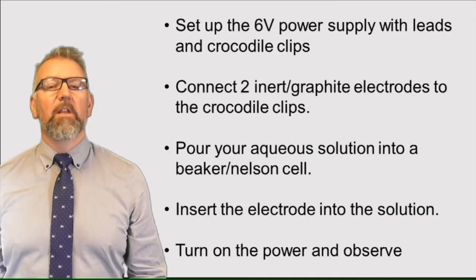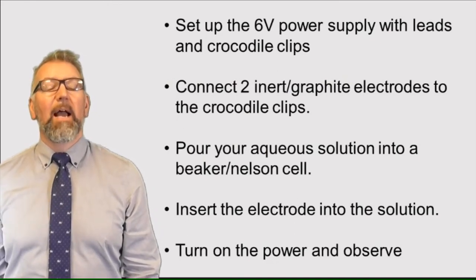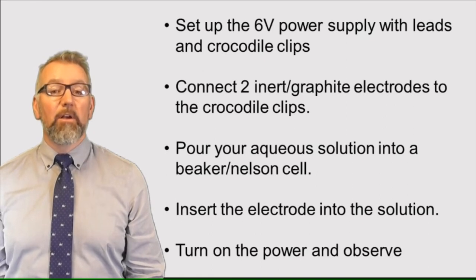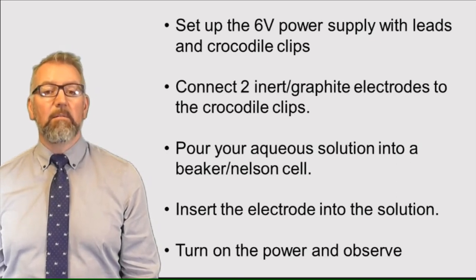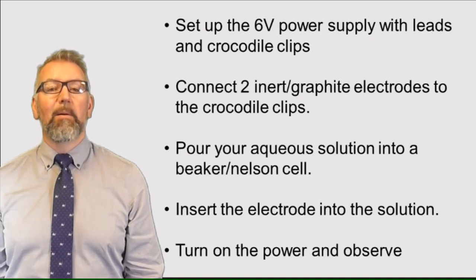Very few questions that I've seen ask you for a method. But if they do, have your method prepared. Set up a 6-volt battery supply with leads and crocodile clips. Connect 2 inert graphite electrodes to the crocodile clips. Pour your aqueous solution into a beaker or Nelson cell. Insert the electrode into the solution. Turn on the power and observe.